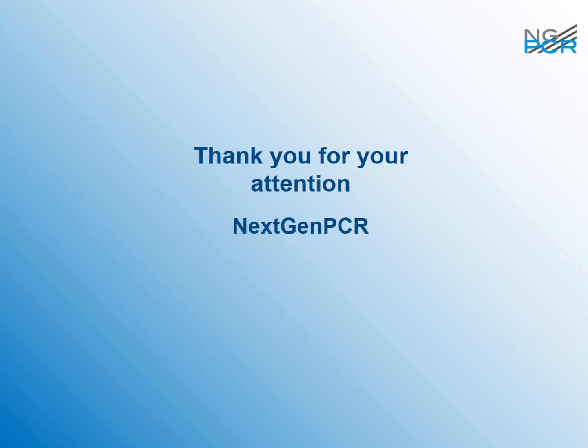Right, okay, which I think answers the next question. The next question basically asked, are there any particular vendors or polymerases that work best with the instrument? But I think you've made clear that most of them will. Yeah, and we tried quite a vast number of other enzymes also with demos at customer sites, and we hardly ever saw any problem. Only if you have a Taq that needs 15 minutes of denaturing, you lose time.